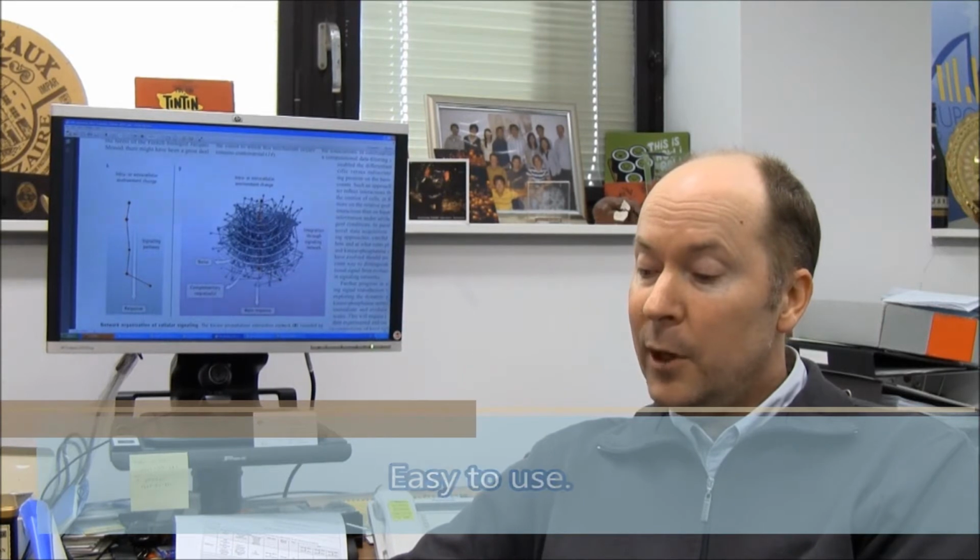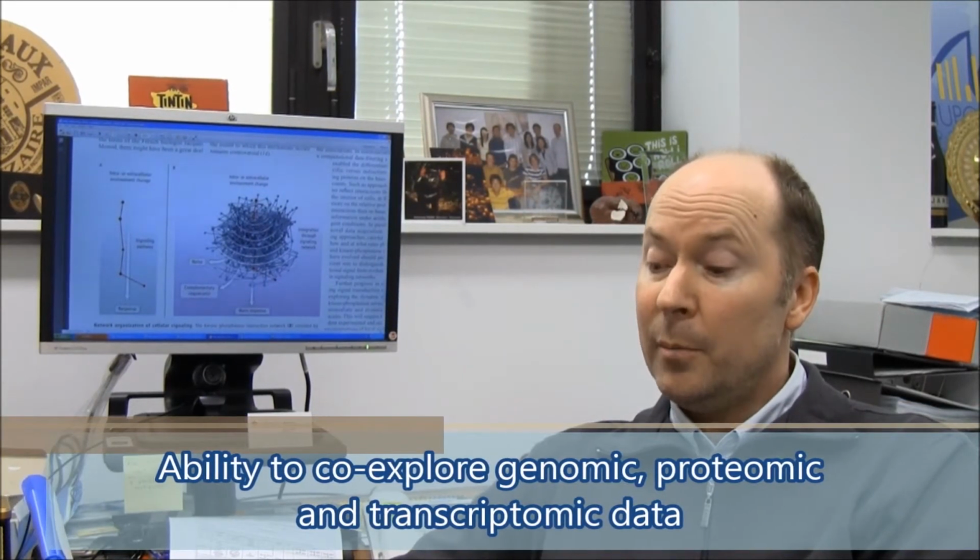Now, we're fortunate in that the Australian National Data Service, otherwise known as ANDS, saw this as an important imperative, and we're in a position to fund this work. So through their support, we've built a software platform to do these complex cross-comparisons. But these tools are designed to be easy to use, and we expect they'll help many researchers to really co-explore genomic, proteomic and transcriptomic data.